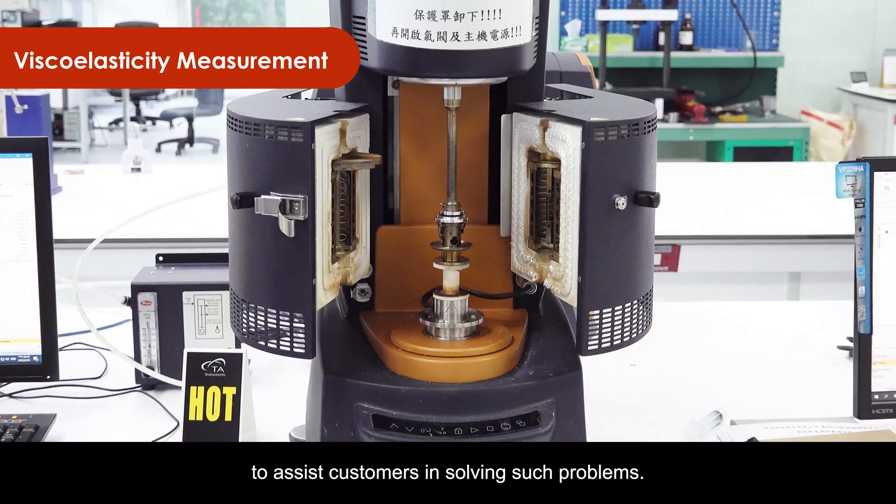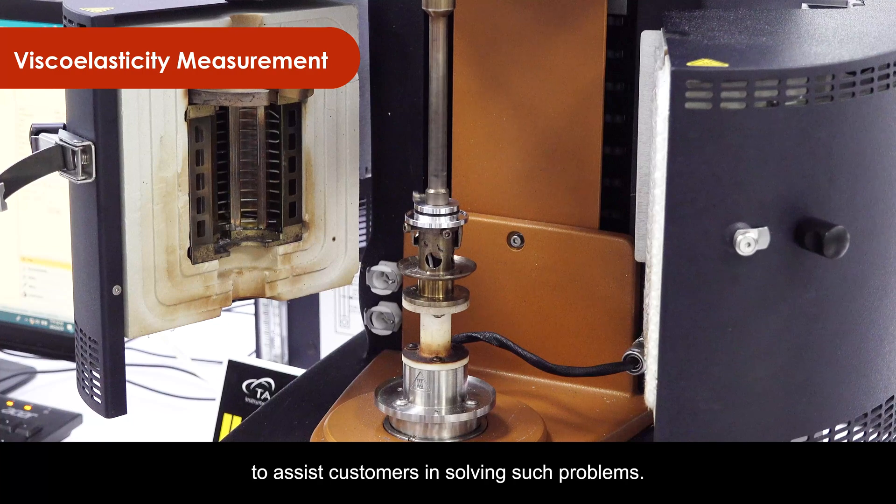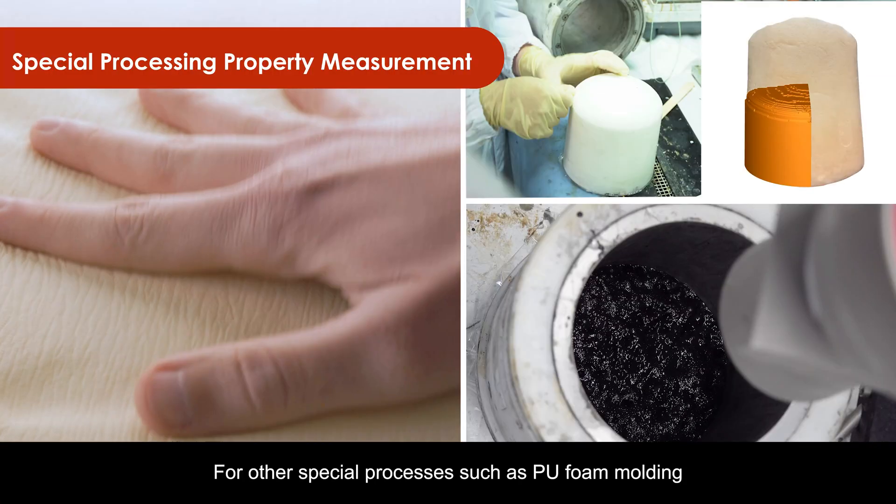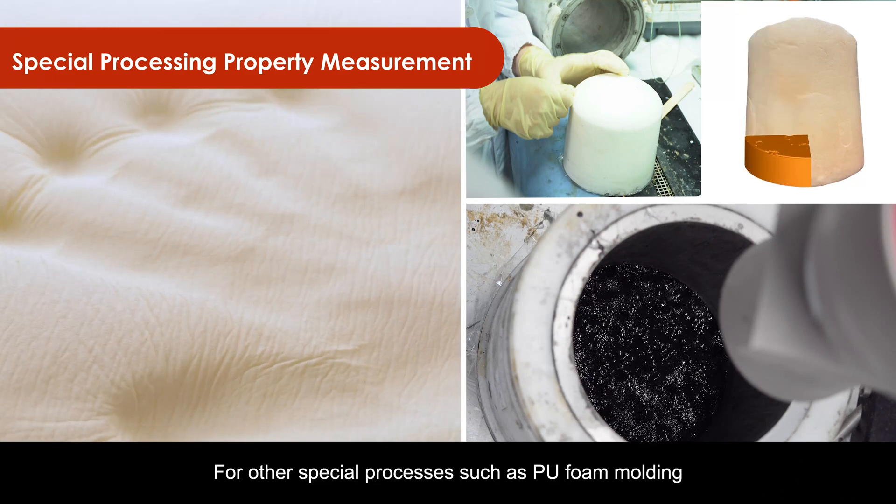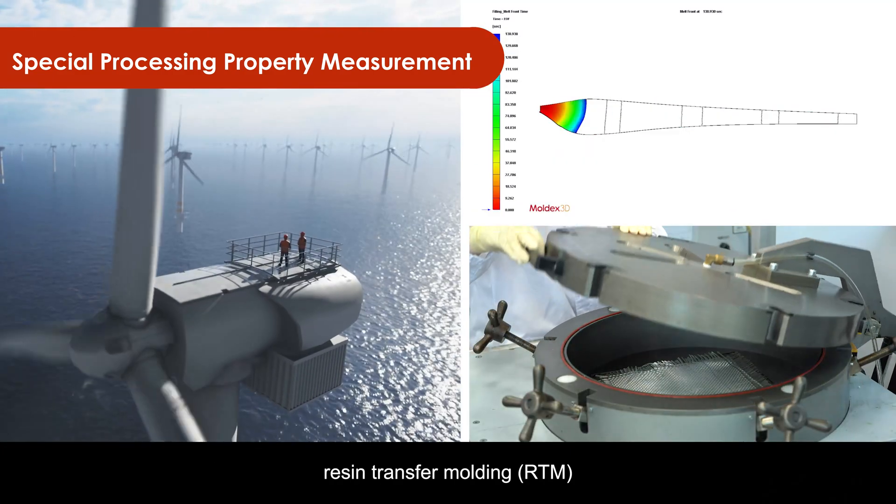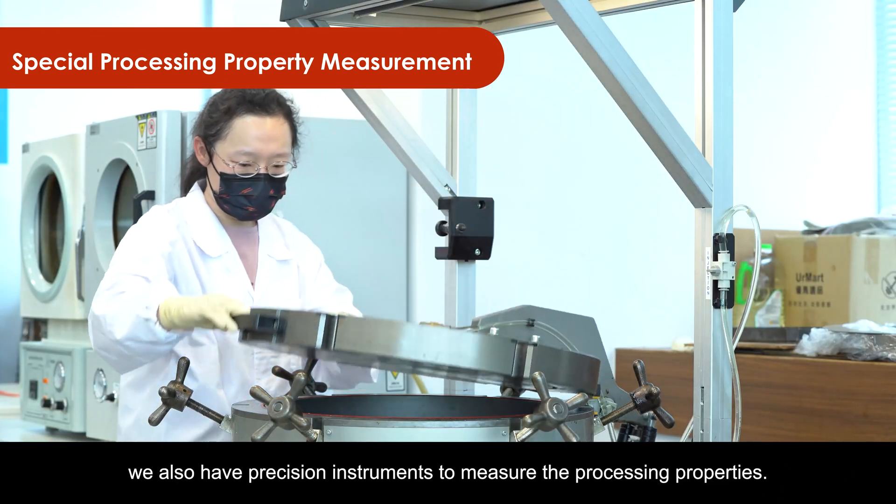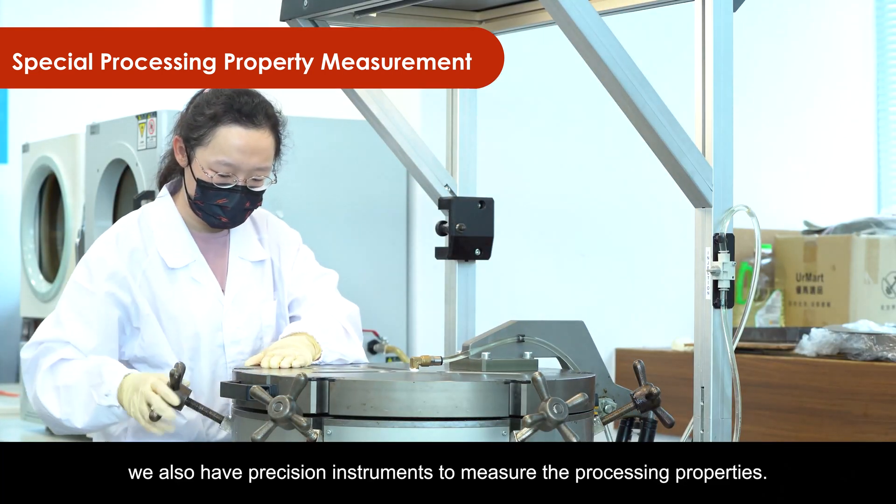to assist customers in solving such problems. For special processes such as PU foam molding, resin transfer molding (RTM), and IC packaging processes, we have precision instruments to measure processing properties.